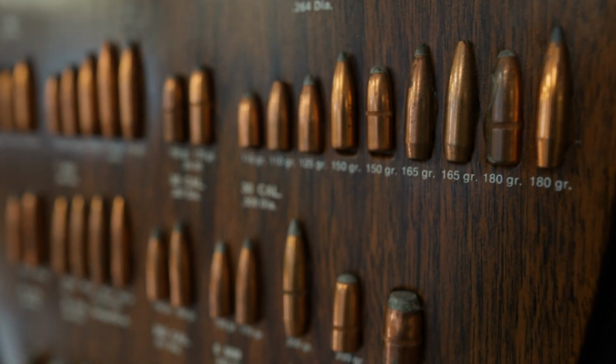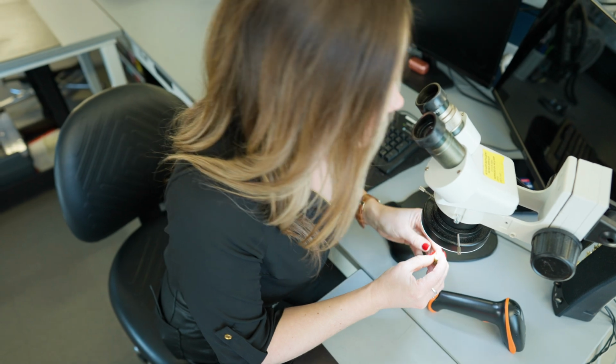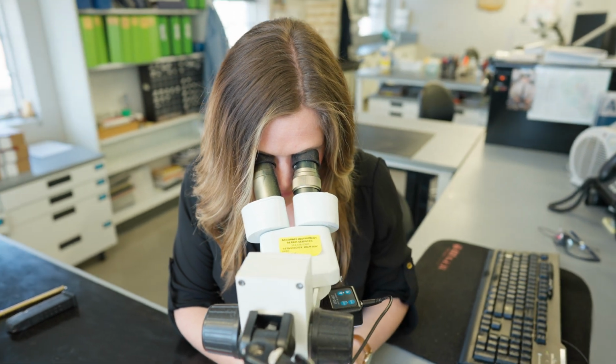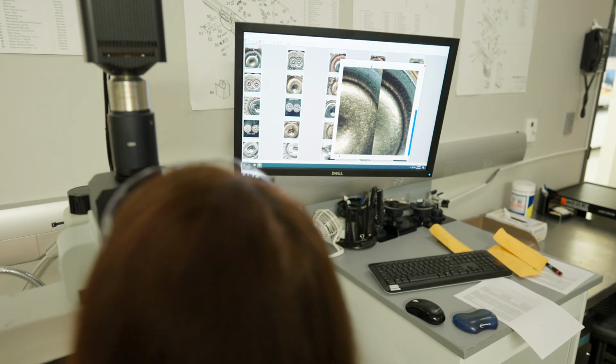Fired cartridge cases and bullets are submitted to the laboratory. These are typically submitted from a crime scene. We can have multiple cartridge cases and bullets, or we can have 1 or 2. The first thing that we do with these is we will open them up at our lab bench. We will look at them under our stereoscope here to determine if first they have similar class characteristics. If we determine that they have the same or similar class characteristics, the next step then is to transition into our comparison microscope, which allows us to view 2 items simultaneously at one time.